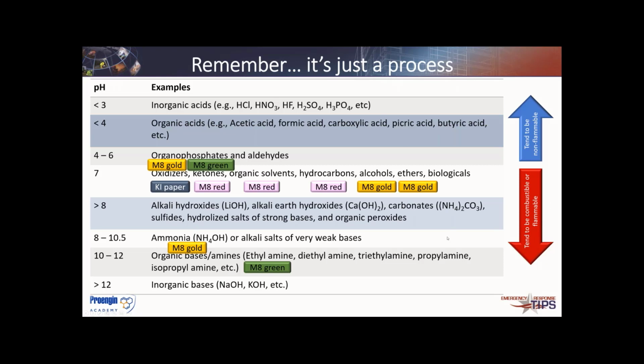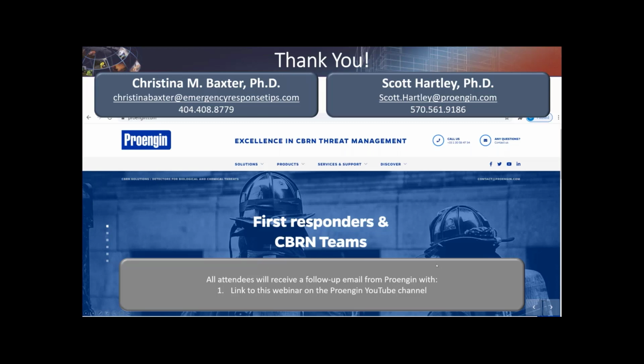And each of these things are where I come to my overarching chart of dividing them out into classes and then using my PID and my AP4C to identify exactly which one based upon the readings I'm getting. And your electrochemical cells, obviously. With that, that was what I wanted to talk about today.